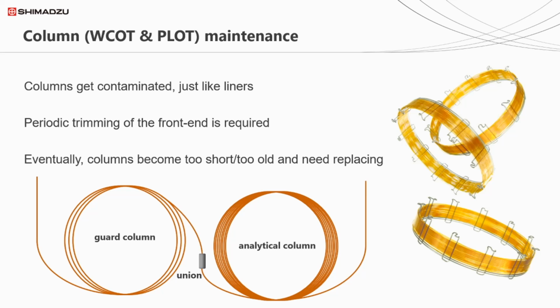On a 30-meter column, it's possible to lose several meters before resolution is significantly impaired. But do remember, adjust your retention times, as all these will shift slightly after trimming.